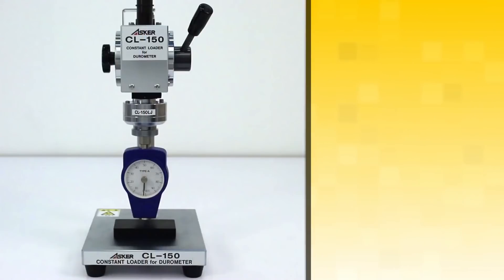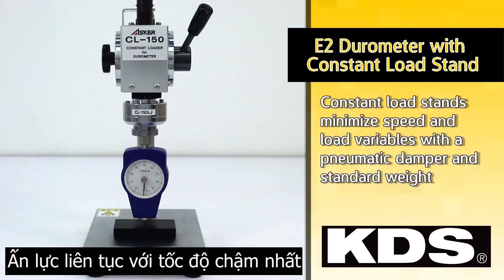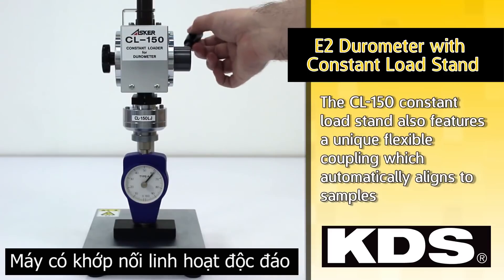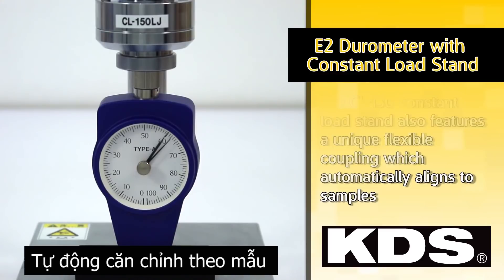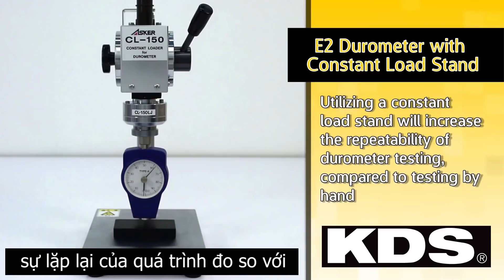The E2 durometer can also be mounted to a constant load stand. Constant load stands minimize speed and load variables with a pneumatic damper and standard weight. The CL150 constant load stand also features a unique flexible coupling, which automatically aligns to samples. Utilizing a constant load stand will increase the repeatability of durometer testing compared to testing by hand.